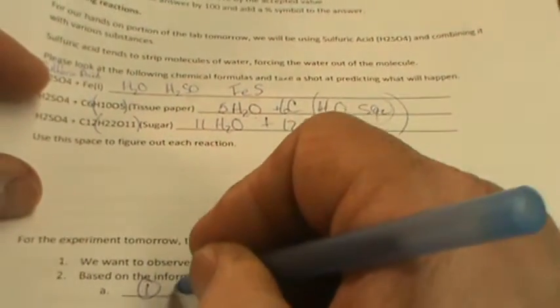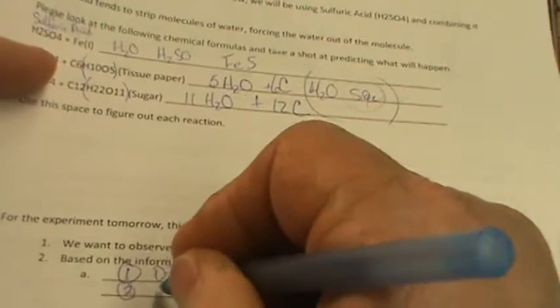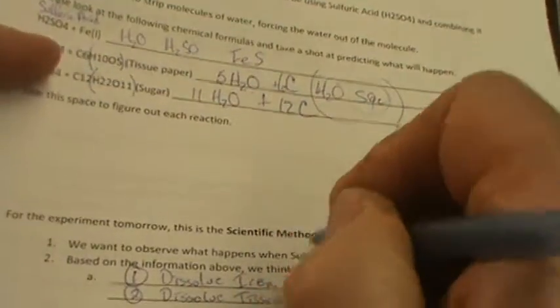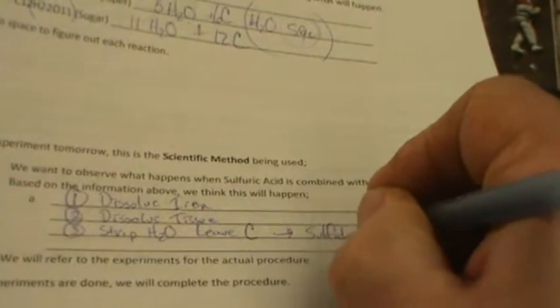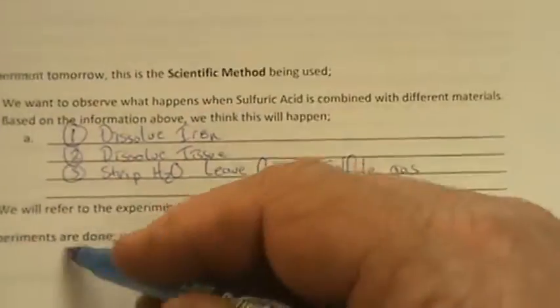Well, in the iron, we hopefully are going to dissolve the iron. In the second one, we hope we're going to dissolve the tissue paper. And in the third one, we want to strip the water, strip the H2O, and we want to leave the carbon behind. And we think we're going to get some kind of sulfide gas. We're going to get a rotten egg smell out of it. Then we'll refer to the experiments for the actual procedure, and we'll finish it up.